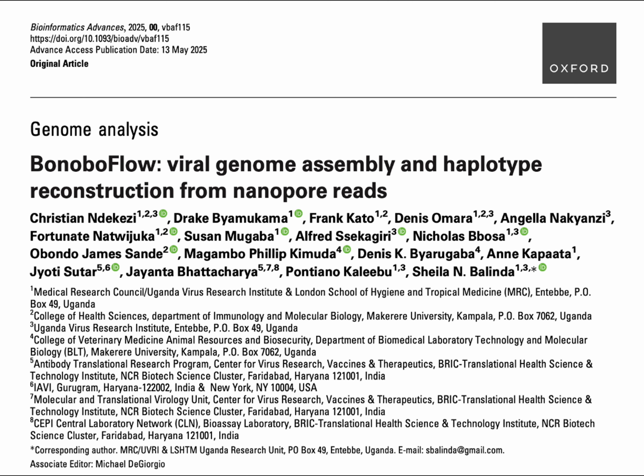It smooths out any remaining small errors, like spurious indels and SNPs. Like adding the final glaze, making sure it's smooth and perfect? A good analogy. And crucially, it includes that frame shift correction step we mentioned. Using tools like Diamond and ProofFrame, it checks the polished sequence for any frame shifts, places where the reading frame might have slipped. Right, ensuring the genetic instructions are read correctly, making sure the sentences make sense. Exactly. That's vital for predicting the correct proteins.